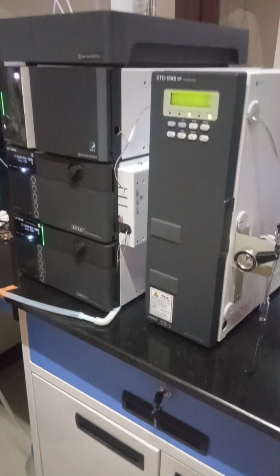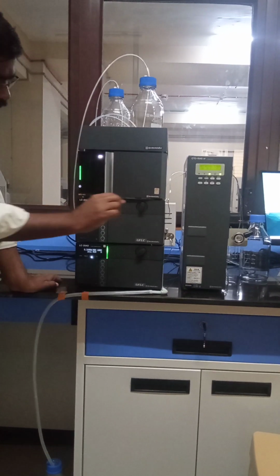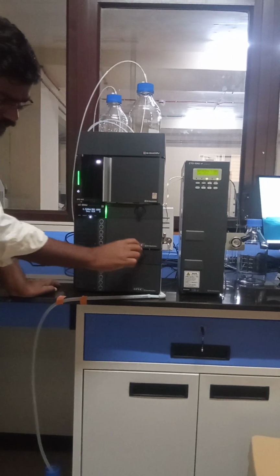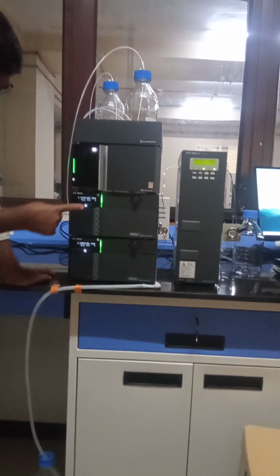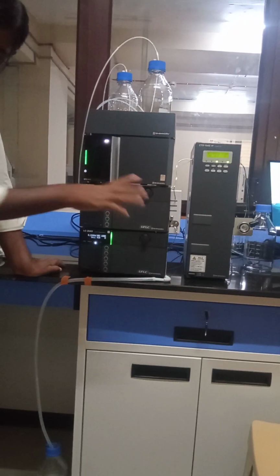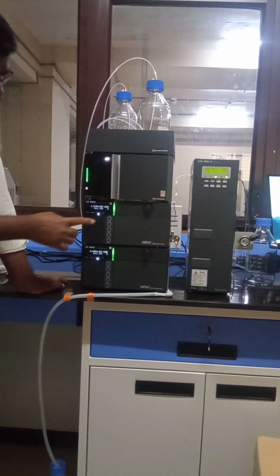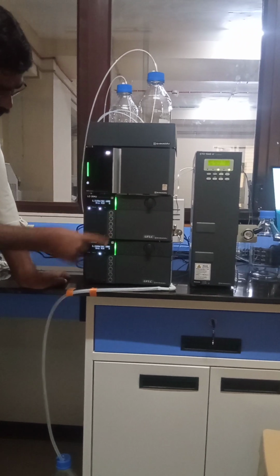Before the unit is completed, close the purge valve, the manual type. Before purging, you have to connect it. Why am I telling you this now? You should remember the purpose. Then press pump A and pump B.